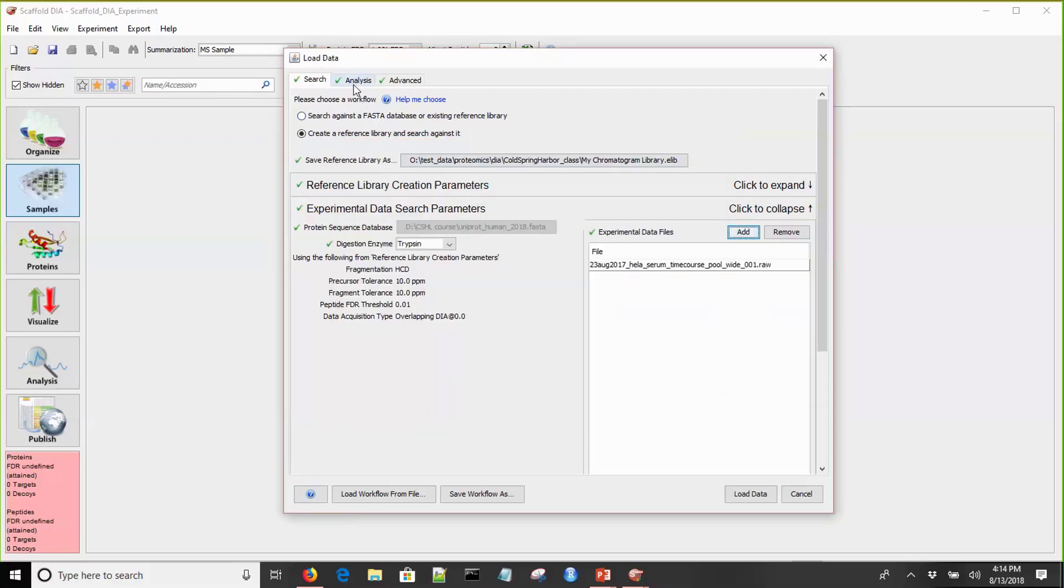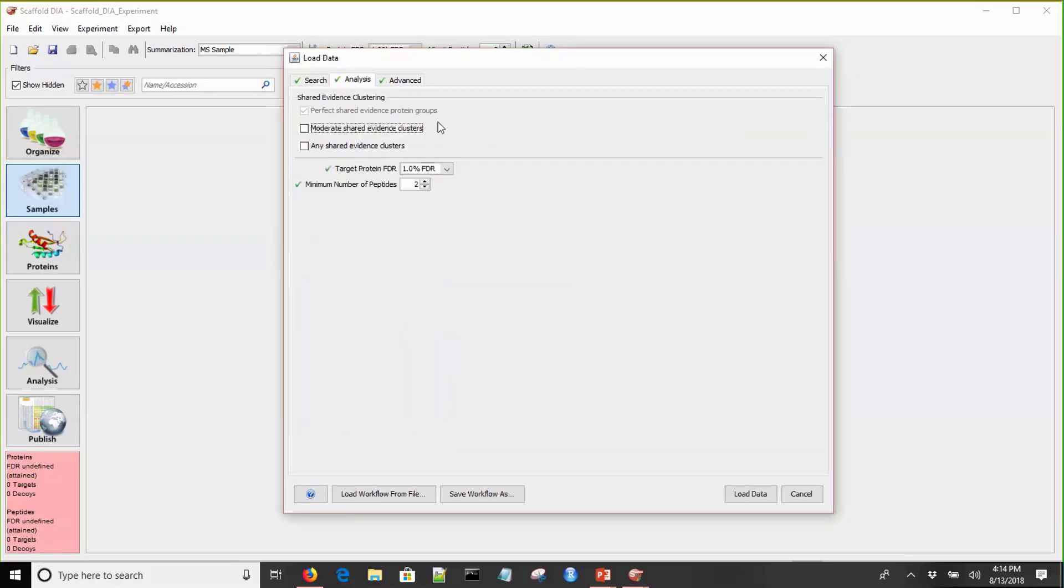If we move over to the Analysis tab, this sets a couple parameters that you can redefine after your data is loaded, including shared evidence clustering, the target protein FDR, and the minimum number of peptides.